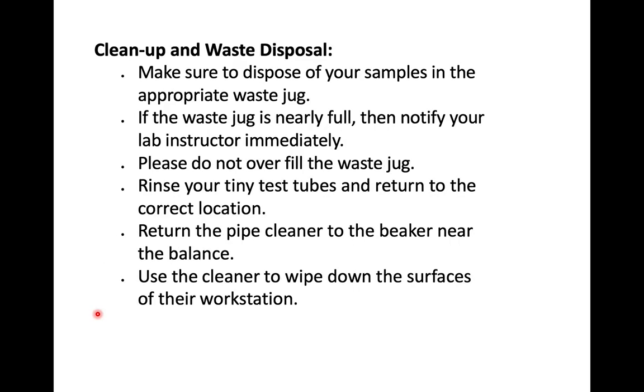Cleanup and waste disposal. Make sure to dispose of your samples in the appropriate waste jug. If the waste jug is nearly full, please notify your lab instructor so they can ask for a new one. Please don't overfill the waste jug. That'll cause it to flood the hood and make a huge mess for you and your lab instructor.